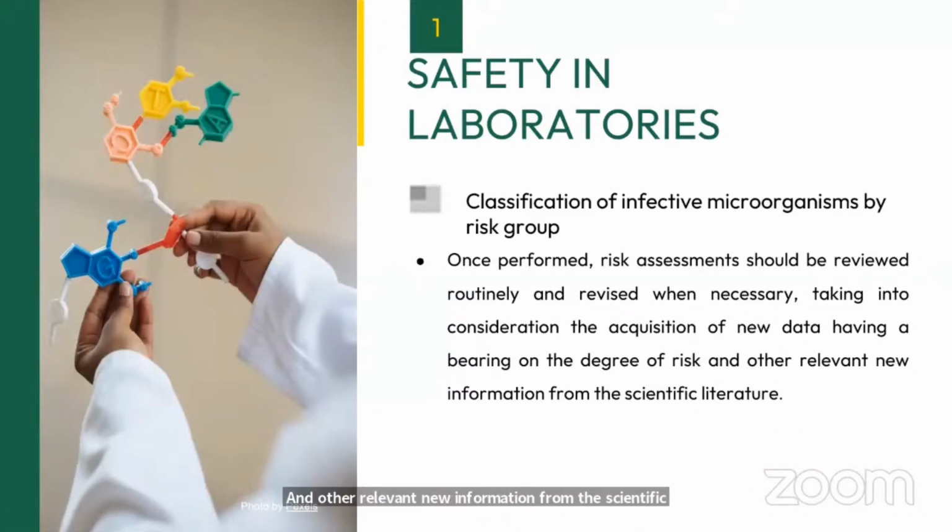So the organism which is considered non-lethal today, there can be some mutations, there can be certain new strains which can be lethal. So considering the scientific literature, the risk assessment should be done periodically and must be reviewed. Depending upon that, you should have appropriate biosafety measures available in your laboratory.